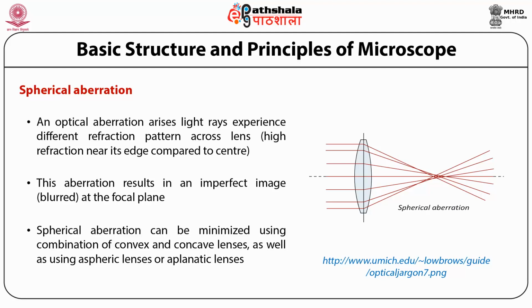Essentially what they do is manipulate the refractive index, thereby bringing the rays coming from the edge or from the center and merging them into a single focal plane, creating a sharp image.